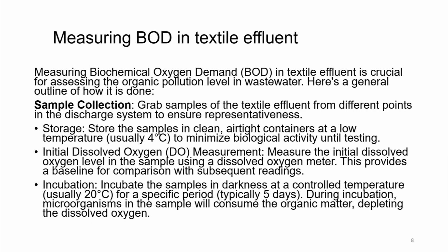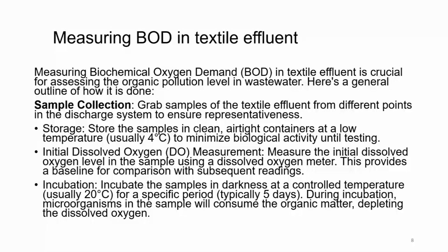Let us now understand how measurement of BOD is done. We had studied this in a few lectures back, but we will re-look at it. Measuring BOD or biochemical oxygen demand in textile effluent is again a crucial assessment of the organic pollution level in wastewater. Here is a general outline of how it is done.